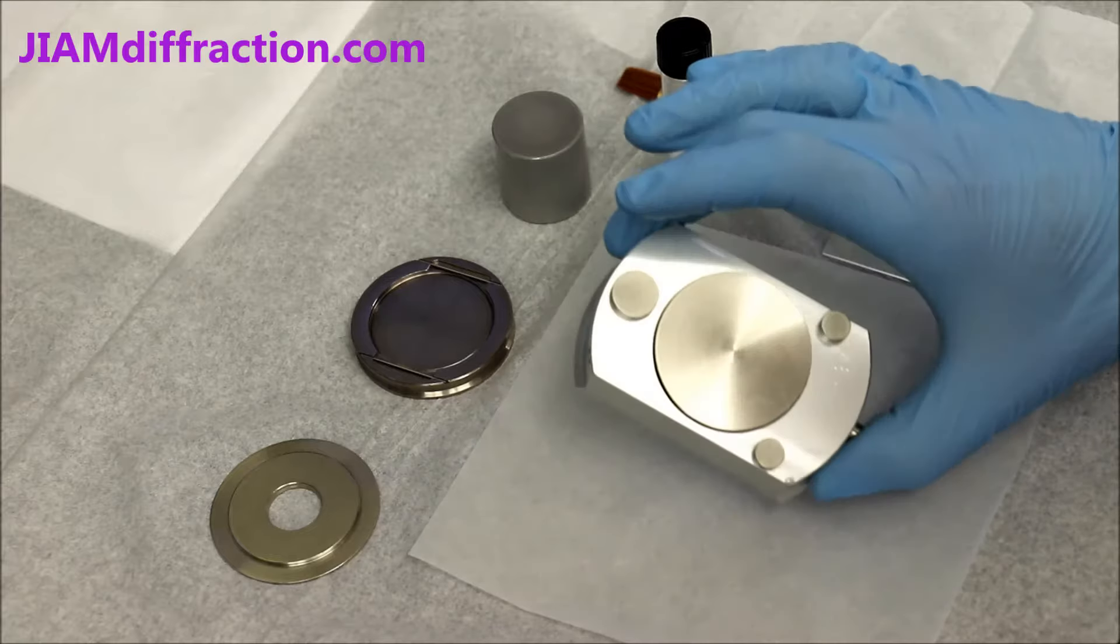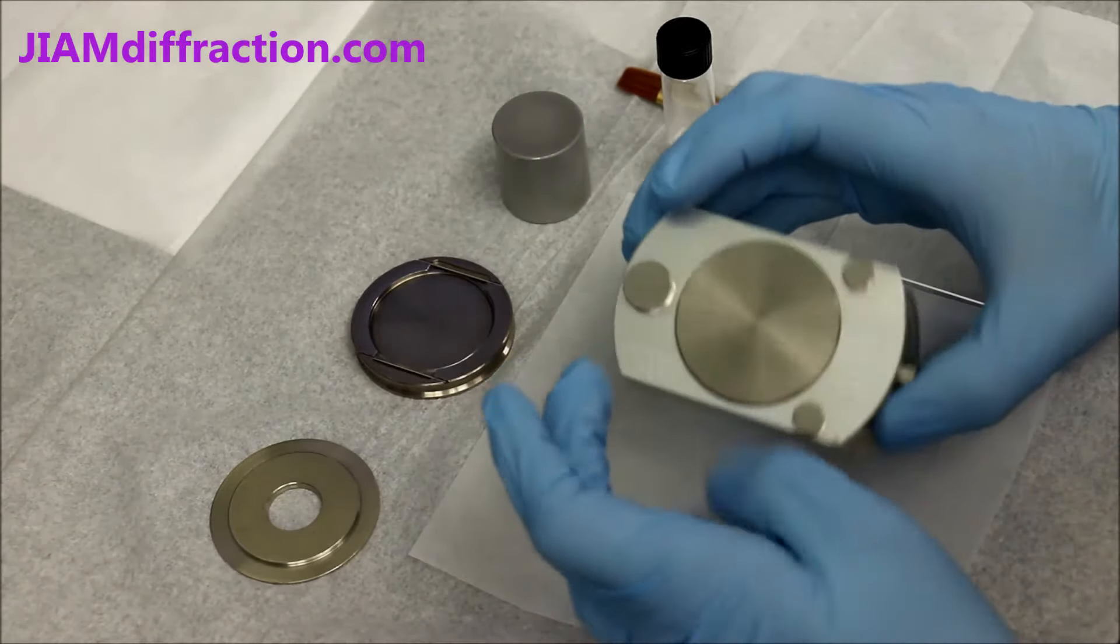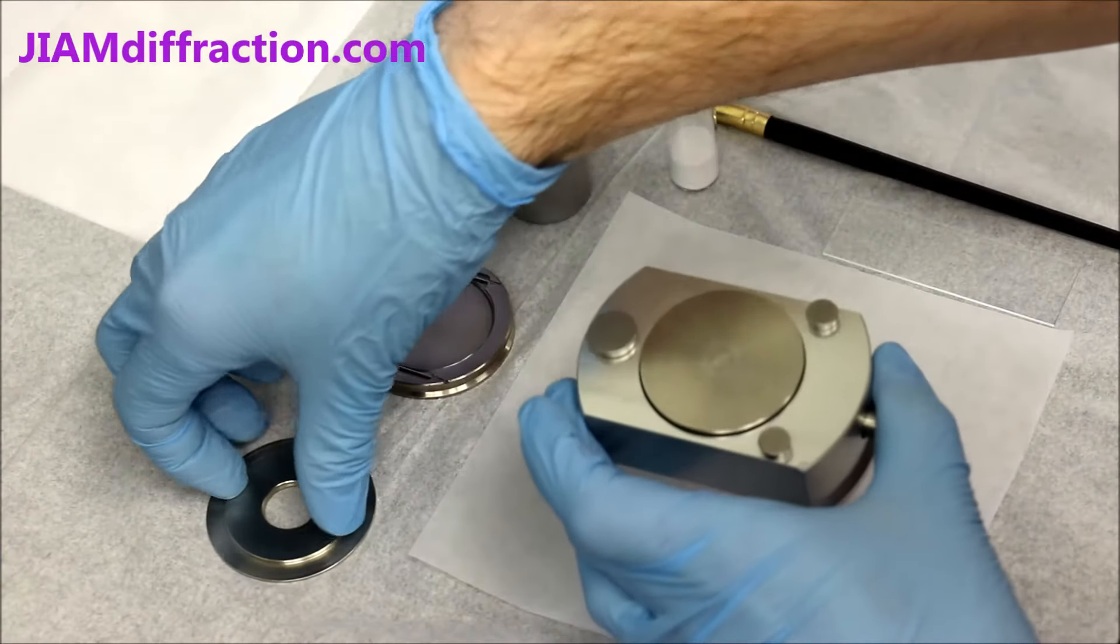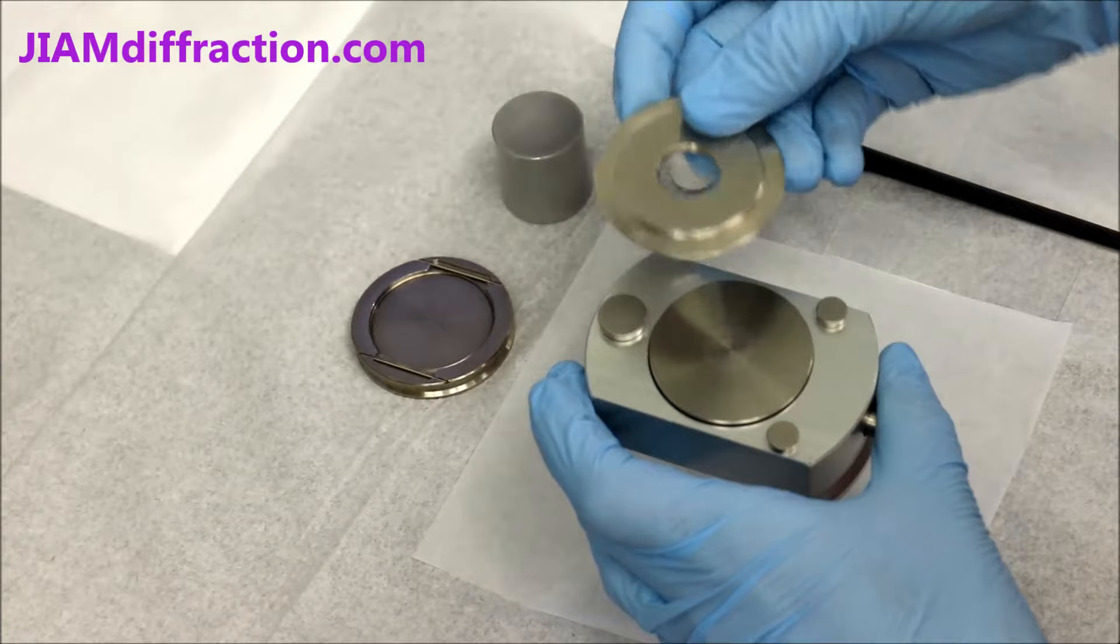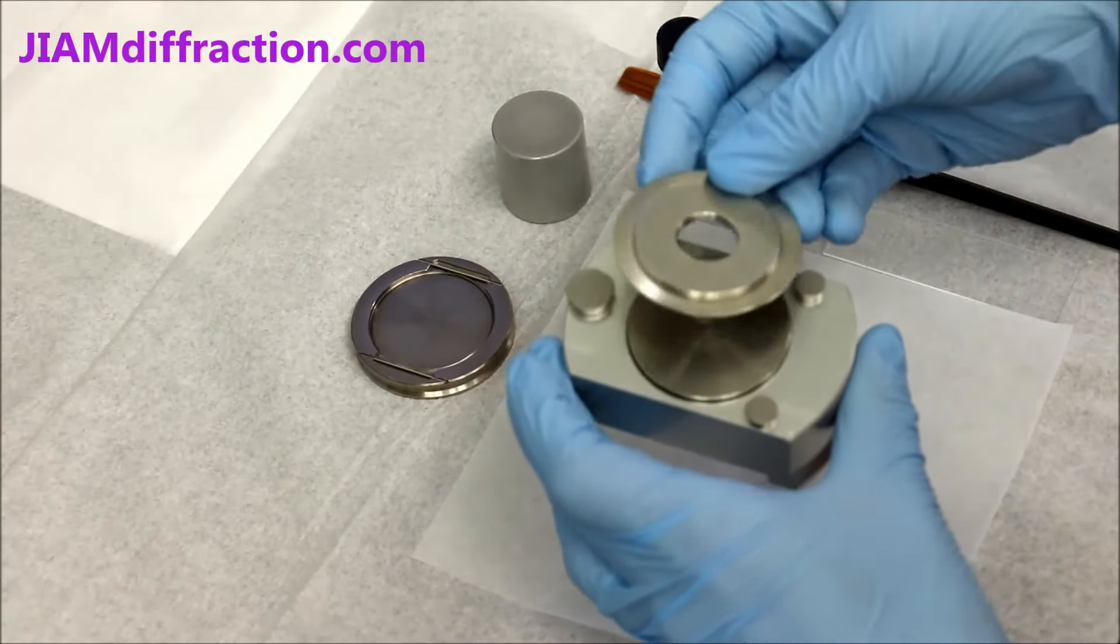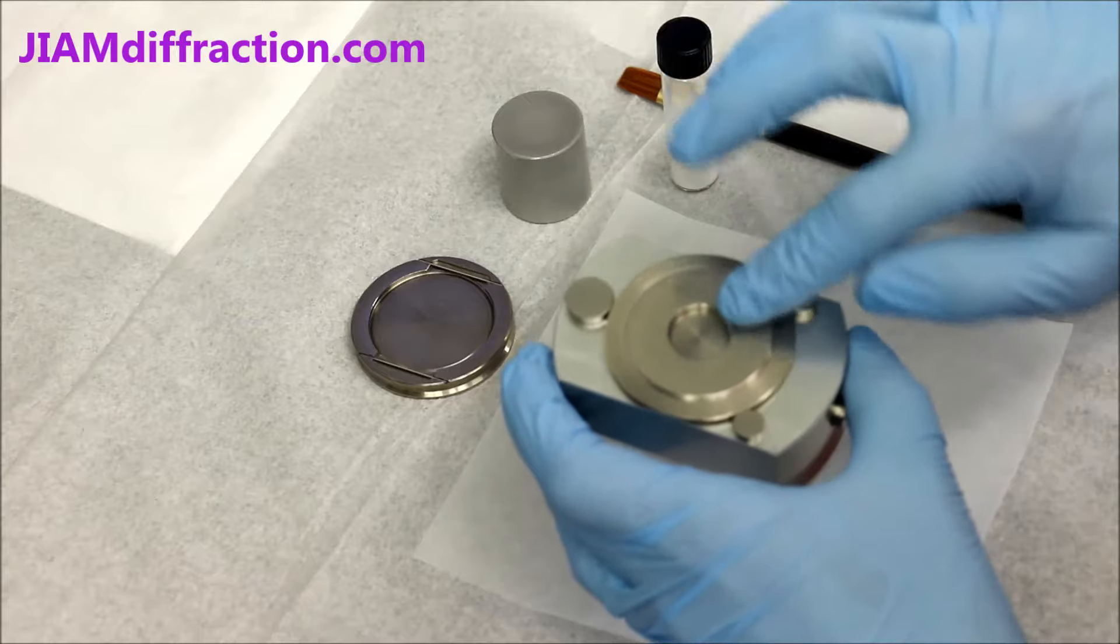The main block is shown here, and on the side there's a button that moves this piece. So what we want to do is take the top part of the sample holder, and with the flat side down, push the button, place it in the center, release the button, and it locks it in place.